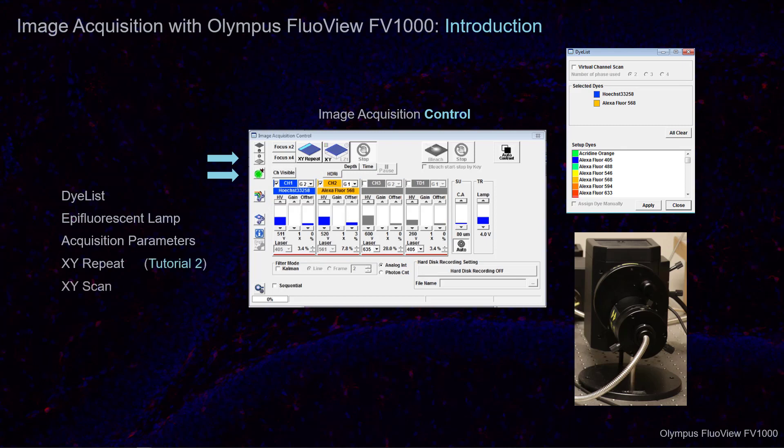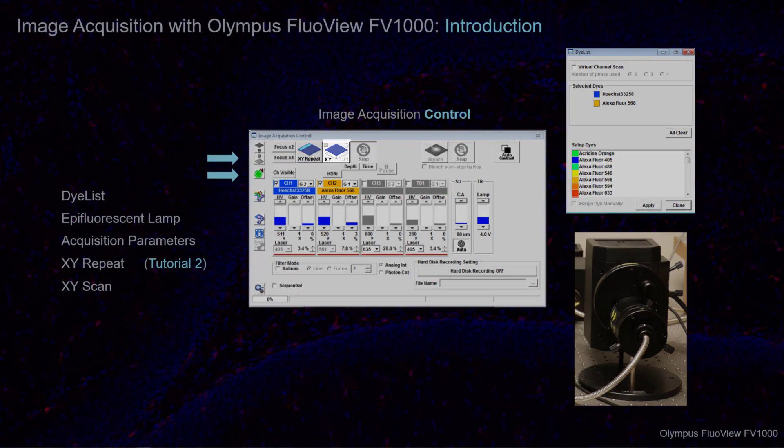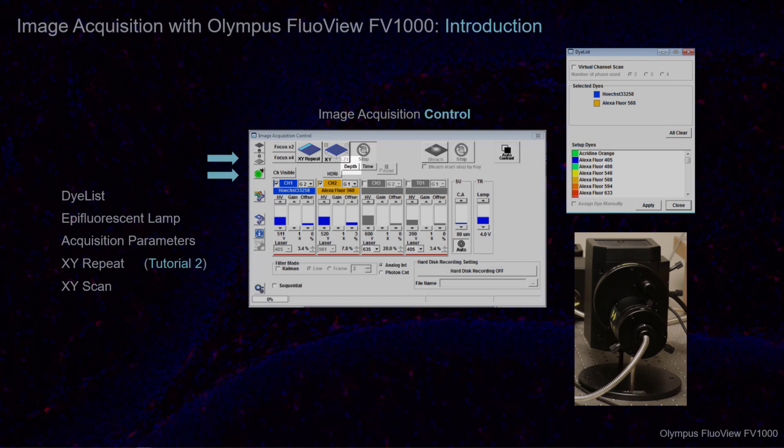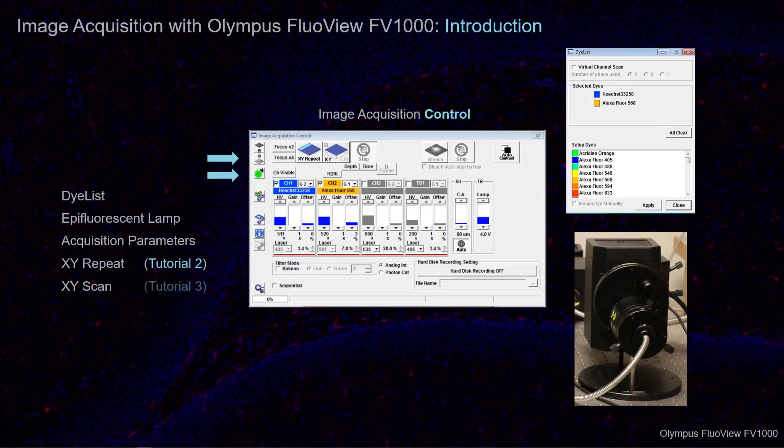Select the XY Scan button to acquire single images, or acquire XYZ image series by first selecting Depth. Refer to tutorial 3 for instructions on how to acquire an XYZ image series.